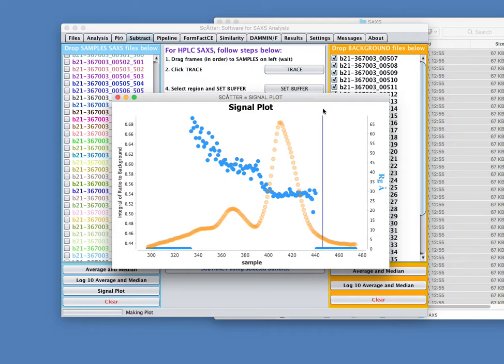Okay, so this is really useful. This curve here is actually BSA. Looks a bit funny. This peak is fairly asymmetric, and there's some other things coming in here as well. You can see that the radius of gyration across the peak is largely flat. It's perhaps sloping up slightly, which is a bit odd. But then at the leading edge of the peak, we start getting larger molecular weight material, with high RG values, and then it goes off to something very large as we look at some of this stuff out here, okay?